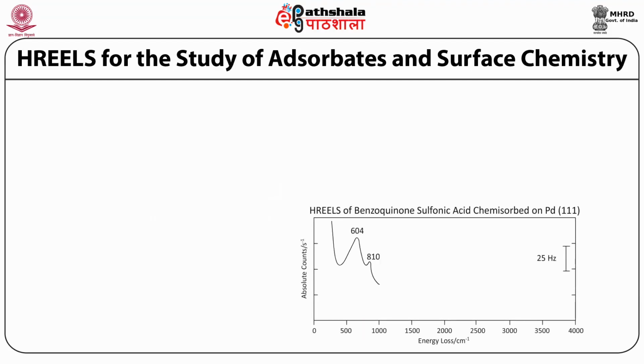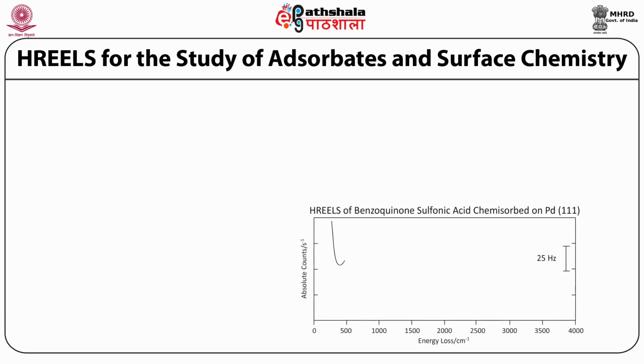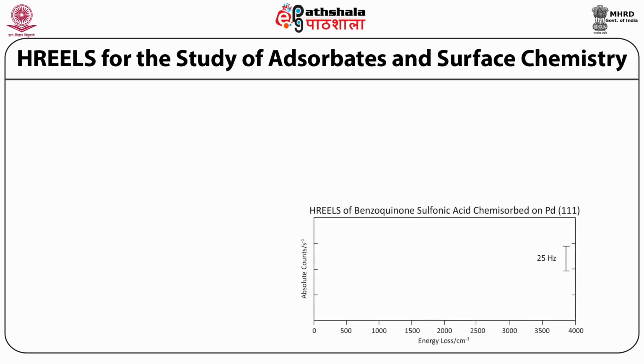HREELS, that is the spectra of benzoquinone sulfonic acid chemisorbed on the palladium 111 surface, has been indicated. Now this spectrum which has been given here indicates the peaks, and it will give the information regarding the way this compound, benzoquinone sulfonic acid, will be chemisorbed on the palladium 111 surface.